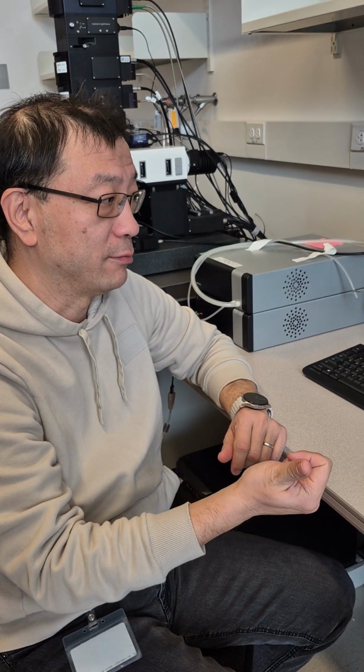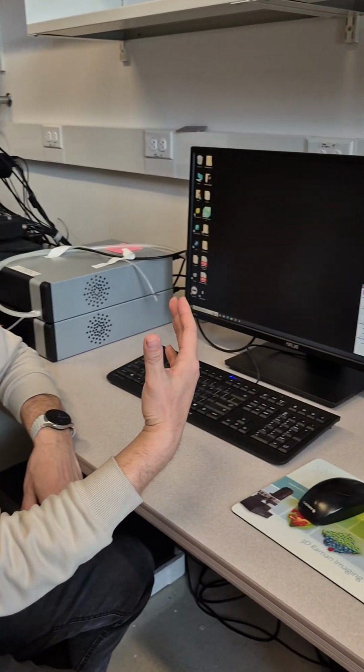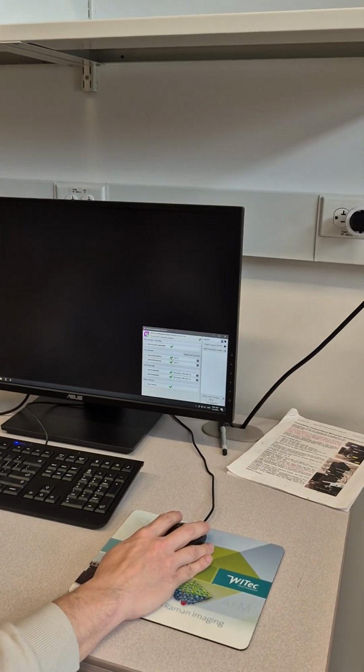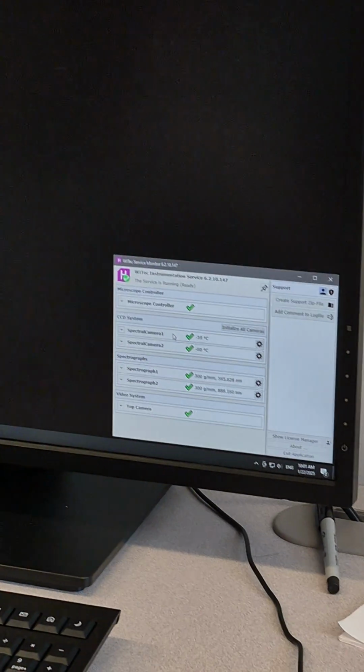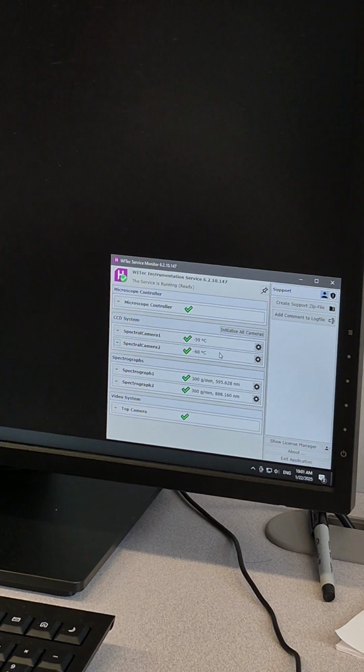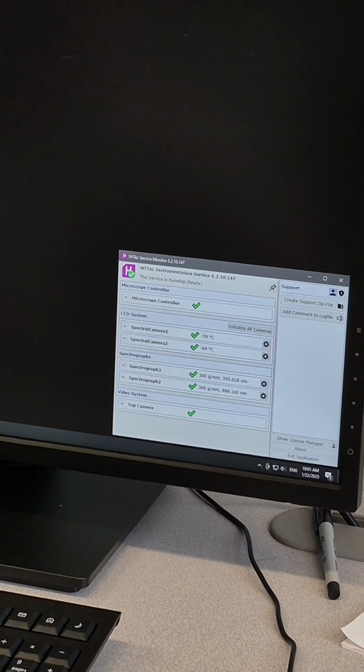It's okay, you just don't collect the Raman. It means the temperature is not stable, but the hardware is good. As long as there's a 6 green check, it means the hardware is good. If you see not stable, it doesn't matter, because we still need some time to bring up the software.